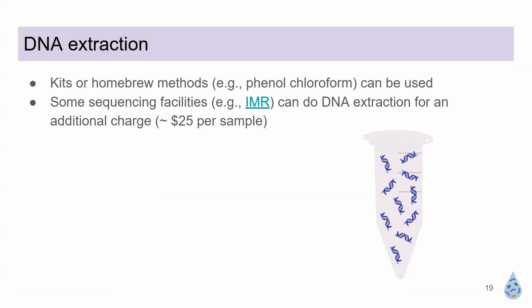And so we're not promoting this particular kit. There are definitely opportunities to get trials from your vendors, and also seek out methods that work for your site. Humics and salts are 2 of your biggest enemies to DNA recovery.